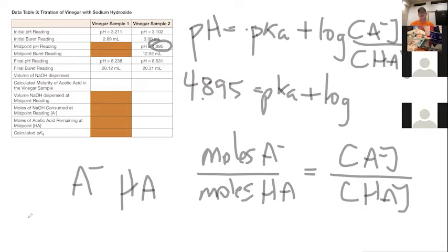Just think about what concentration is. What is the molar concentration? What are the units of molar concentration? Moles over liters. Right. And since we know moles, we'd be able to find out the liters, won't we? We don't need to. Why don't we need to?